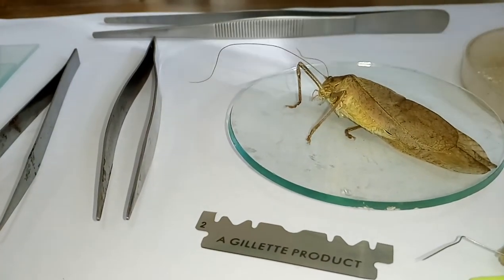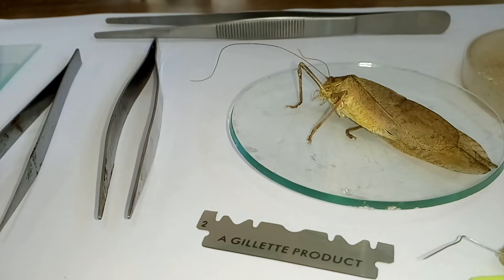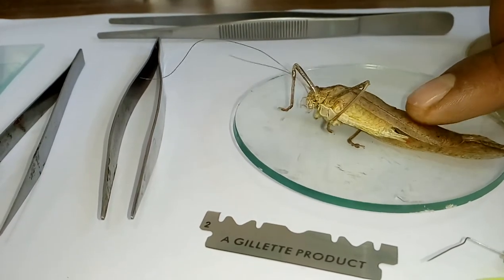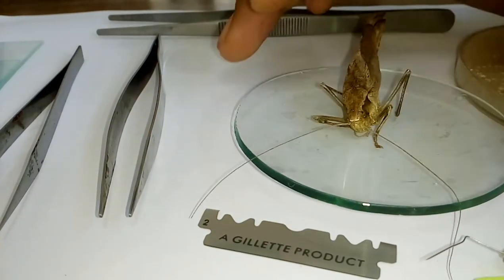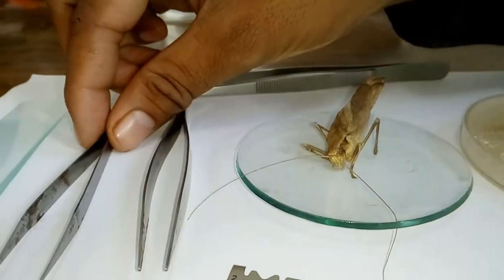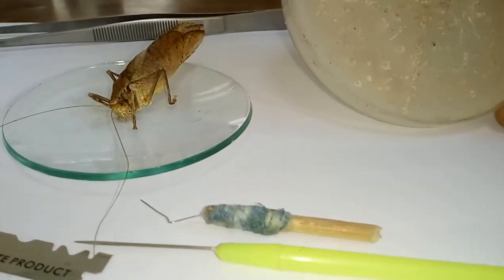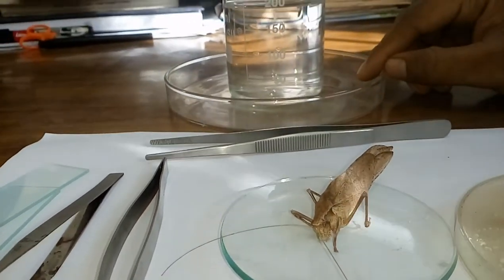Good afternoon. Today we are going to perform the dissection of grasshopper gut and brain. For the dissection of grasshopper, what we need first: a sample of grasshopper — it is a male tetigonid, commonly known as long-horned grasshopper — a petri dish, a long forcep, different fine forceps, slides, needles, and a wax plate with water, and a big petri plate.